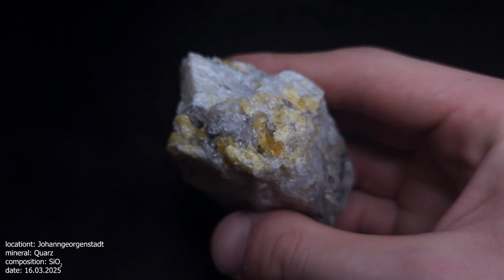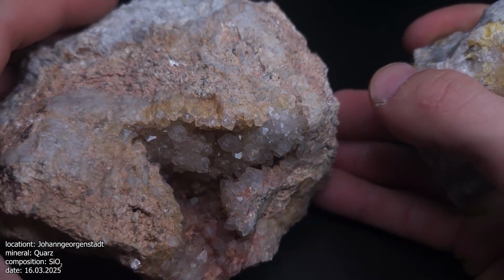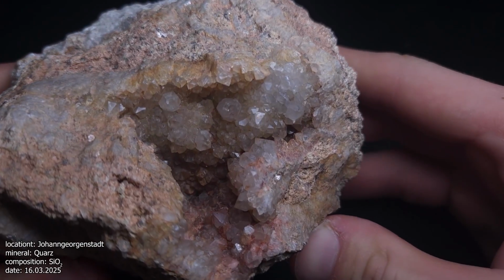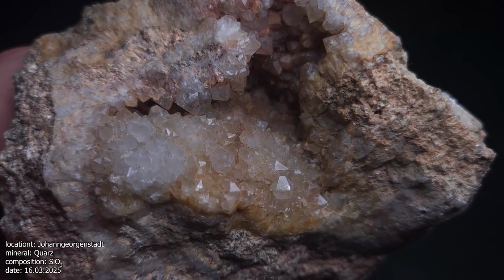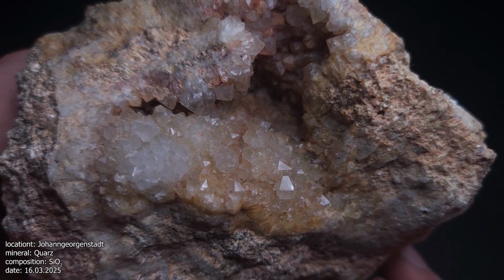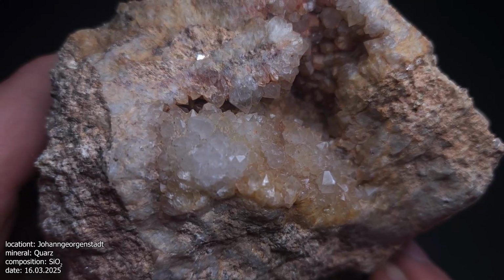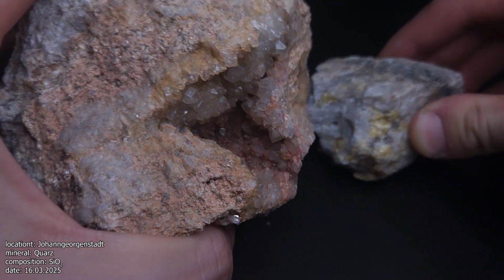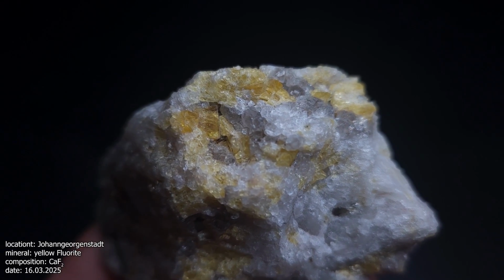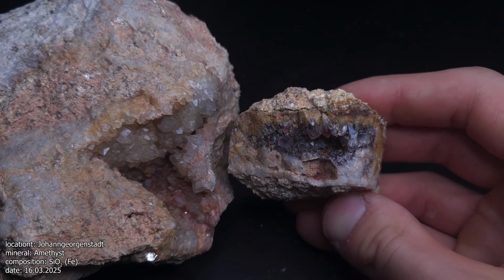In this specimen of a quartz crystal, you would not see oxygen, only silicon. So this fluorite CaF2 and this quartz SiO2 can be distinguished by looking at the crystal form. And you can also classify them quite well with an XRF based on calcium or silicon lines. But with minerals like this, you still need a good knowledge of minerals. This means that these two would look identical in the XRF.